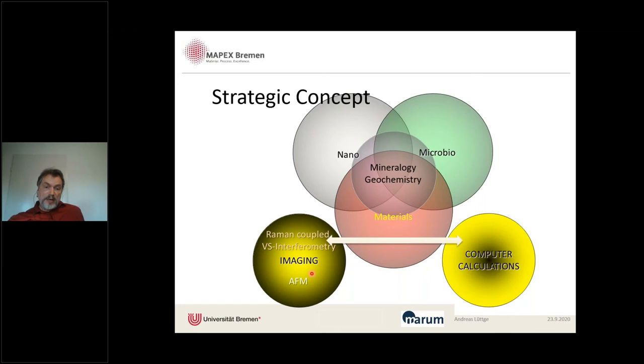That's just one half of what we're doing. The other is computer calculations using kinetic Monte Carlo simulations to predict the behavior of fluid-solid interactions. And so for us, the imaging part is really critical because we need this technology to parameterize our computer codes and also do the validation of the computer models.